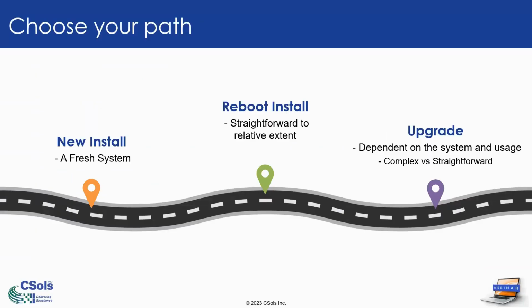You might just be doing an upgrade, which is LabWare 5 to 8 or 6 to 8 or anywhere in between. That will very well be dependent on your system and usage, and that can be very complex, or it could be very straightforward and quick and to the point.